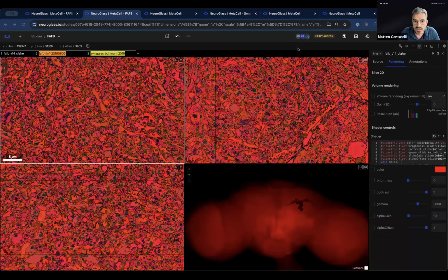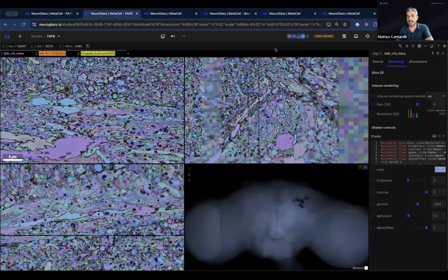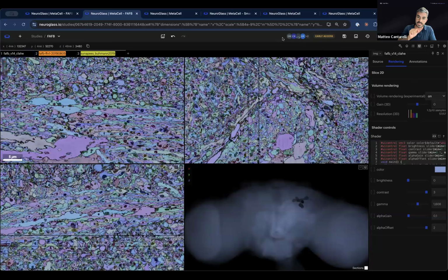And you will see that here there are some avatars appearing because you're joining a live study. This is a feature we call live presence, and this is the very essence of people being in the same space. It is possible to click on any of these and see what that particular person is looking at. For instance, now I clicked on Sean, and I'm looking at what he is looking at. This is just a snapshot, but in the future we will also have follow live.